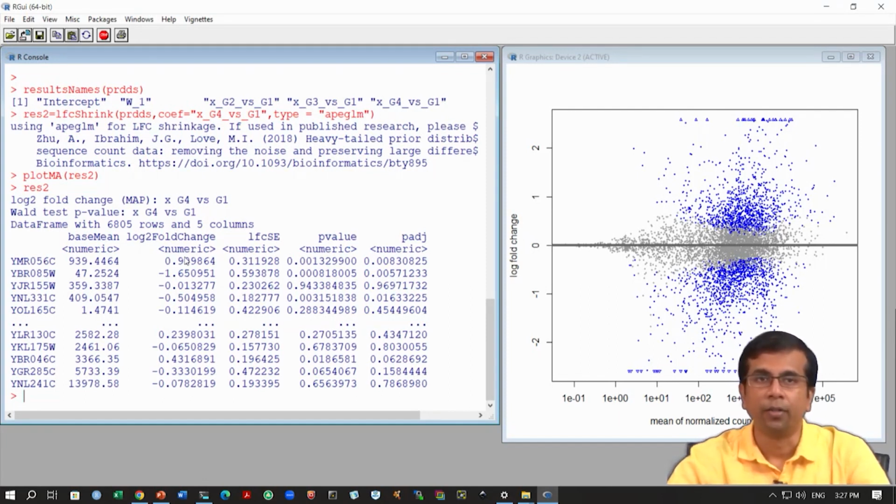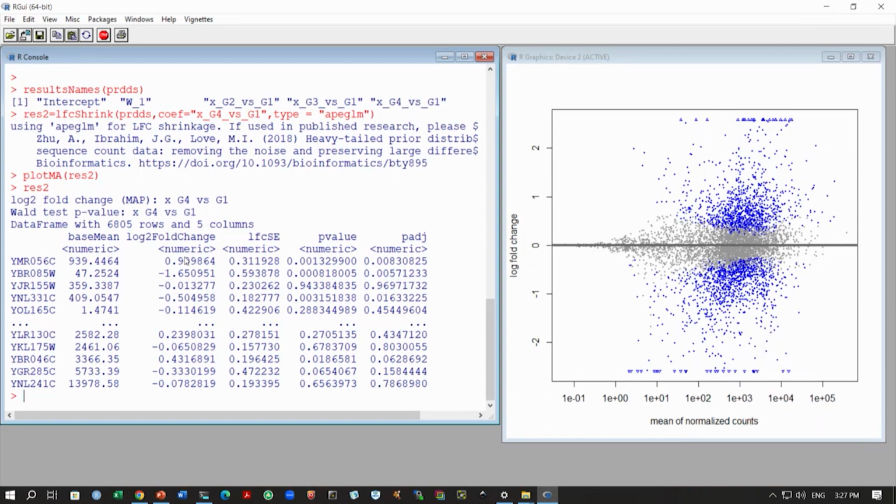Okay. So, this completes our differential expression analysis, and what we want to do beyond this MA plot is look at some visualizations, for example, the volcano plot or the heat map, and we also want to look at the gene set enrichment analysis. So, the functional enrichment analysis we have talked about. Very briefly I am going to show you how we can do that. There are different tools, but we will use one tool and we will complete that analysis, but that is for the next class. Thank you very much.